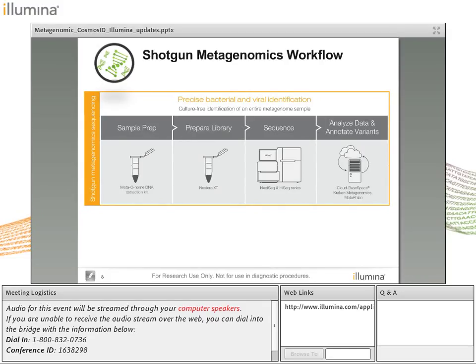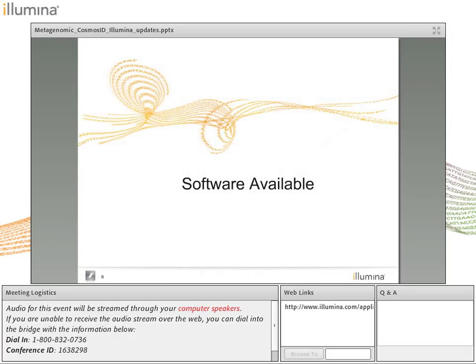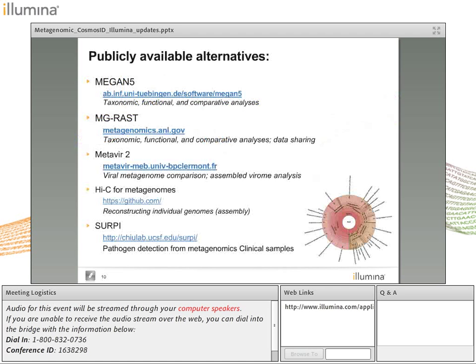And in BaseSpace, you have multiple software tools available to you. Now, there is lots of software available out there. And publicly available, you have MEGAN, for example, which is the metagenome analyzer. It identifies microbial organisms contaminating a sequence study of the DNA and can rapidly compare multiple data sets and classify the functions of genes in the metagenome. Kraken is another way of doing metagenomics. It takes short DNA sequences from metagenomic samples and assigns them to taxa faster than conventionally used programs.